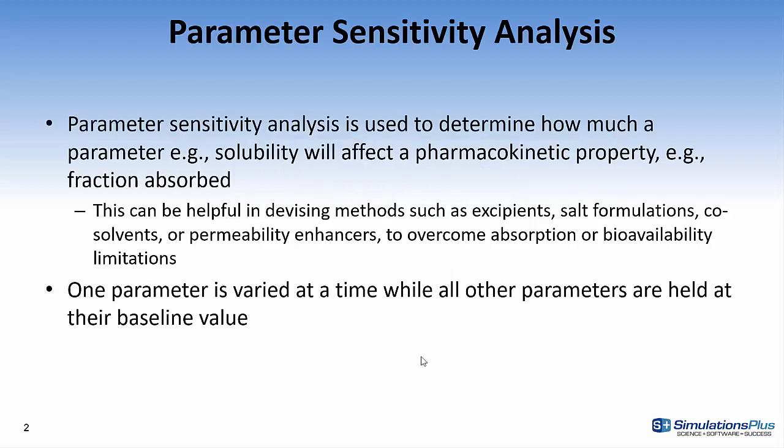Parameter sensitivity analysis is used to determine how much a parameter, such as solubility, will affect the pharmacokinetic property, such as fraction absorbed. This can be helpful in devising methods such as excipients, salt formulas, co-solvents, or permeability enhancers to overcome absorption or bioavailability limitations.